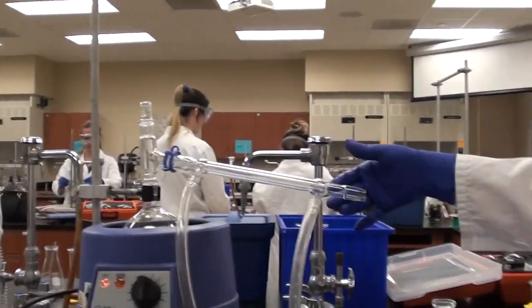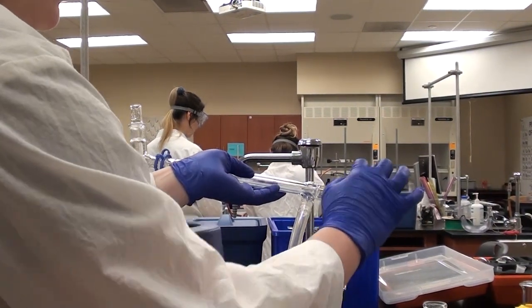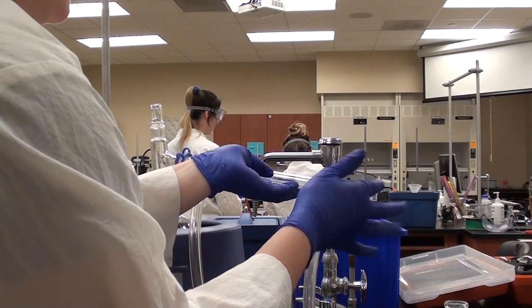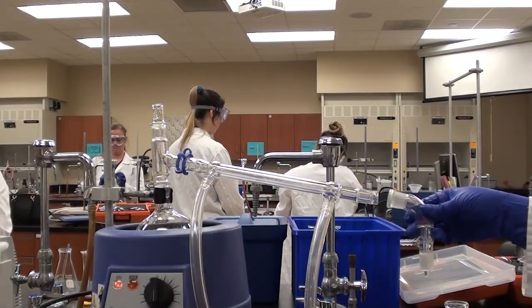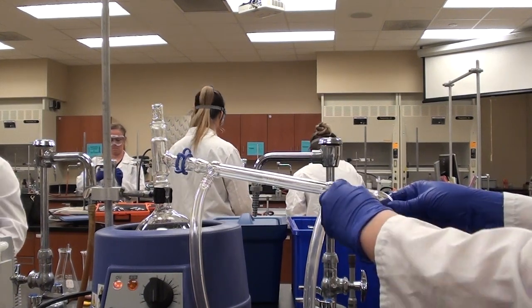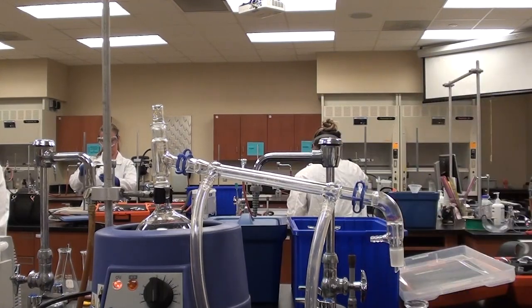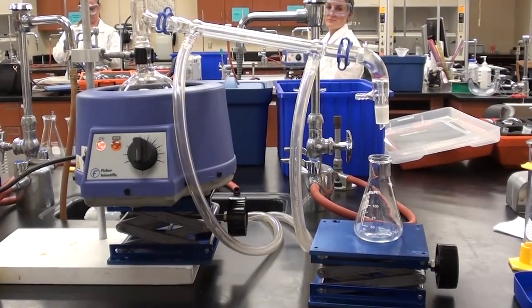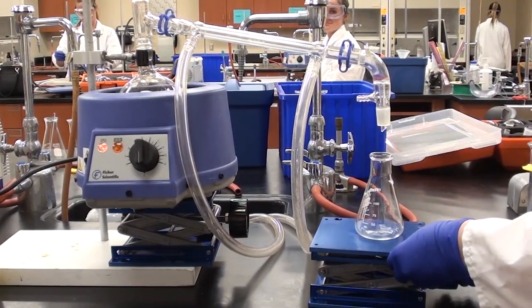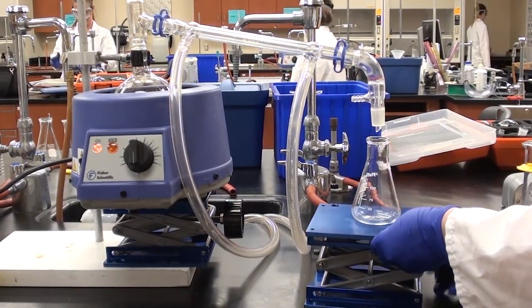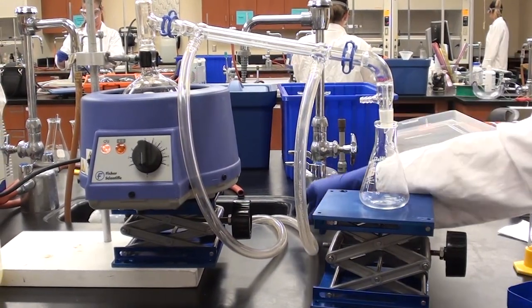Now we're going to grease the end of the condenser here. Then we're going to put the receiving adapter on the end of that, and that gets a keck clip as well. We've got a lab jack set up with a receiving flask at the bottom. Could you please raise that receiving flask so it's inside the collection adapter? Now we're ready to get started.